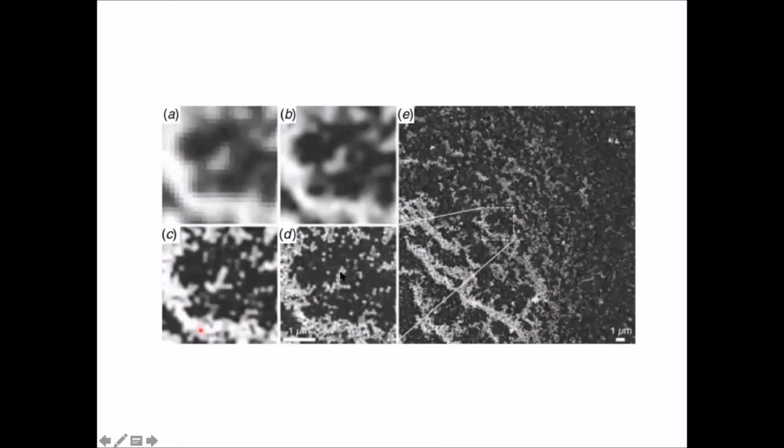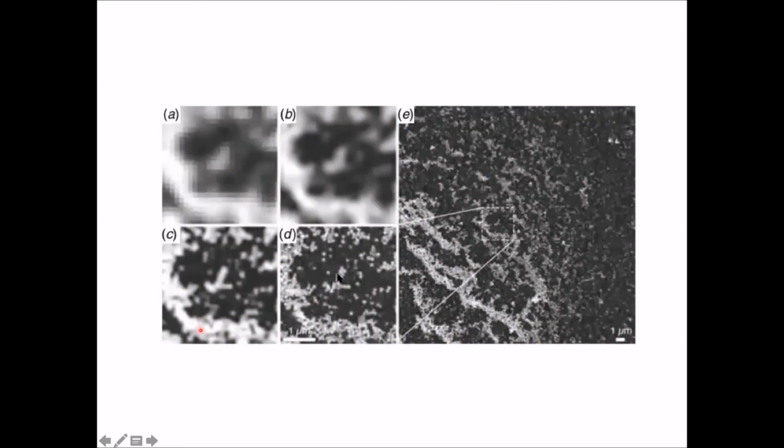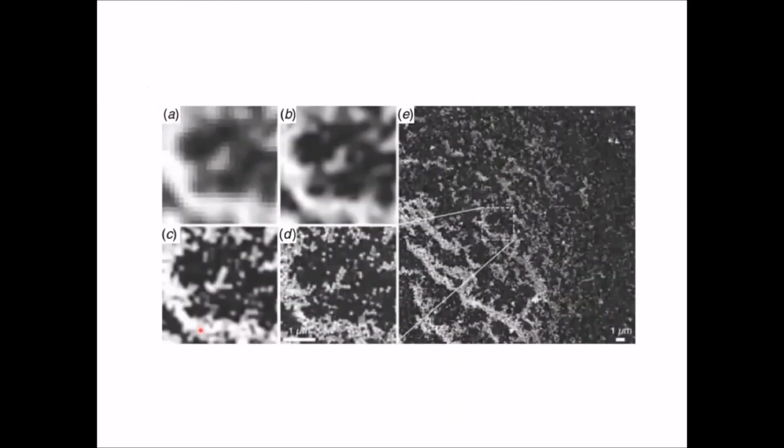But all of these methods require huge amounts of fluorescent dye and lots of light. So even though you may hear that people are studying things that are live, the only chance, even the small chance of doing it live, is with structured illumination. And that means that if you're doing biology, which is a lot of the optical microscopy that people are doing, okay? And one more thing is that you have to use a lot of light. So you need a sample that can stand this type of light.